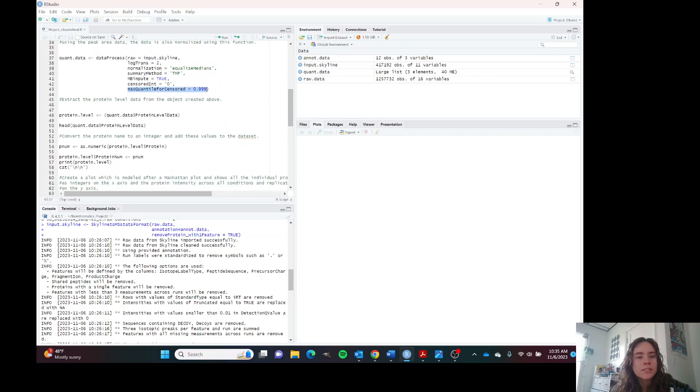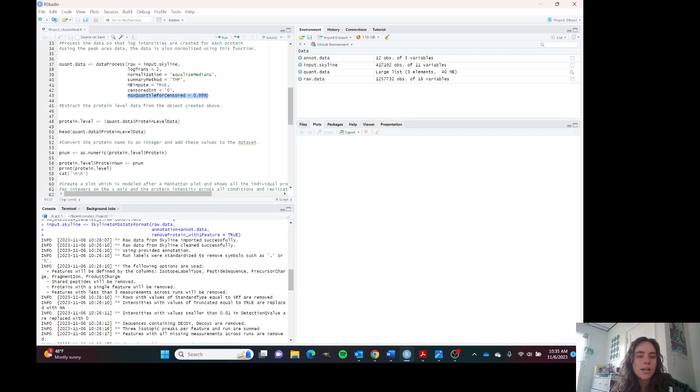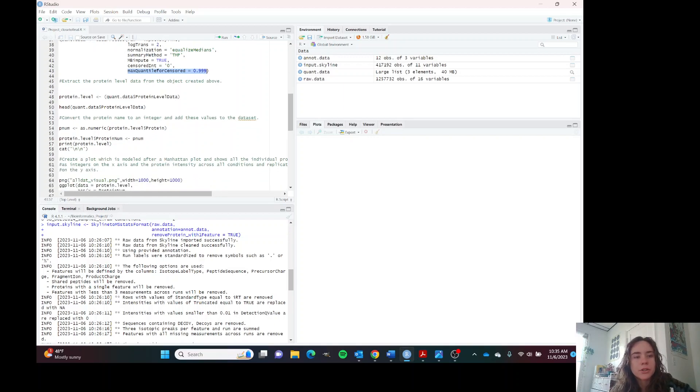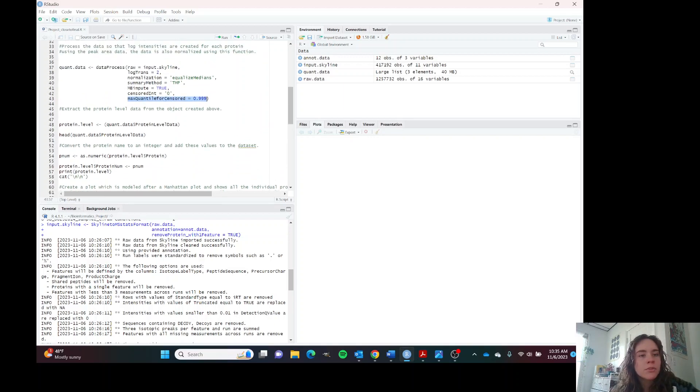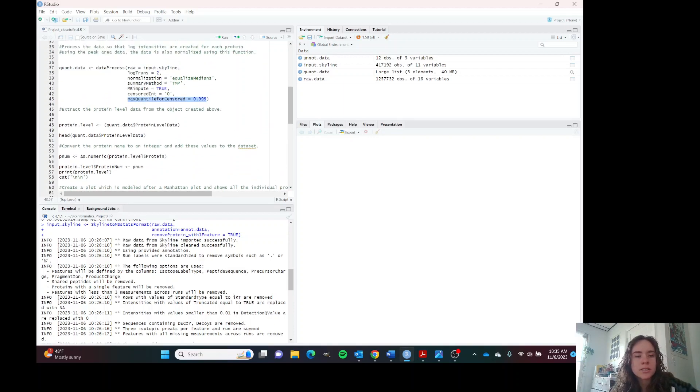I've already run this. It does take a while. It takes like three minutes if you're going to run it on your own.